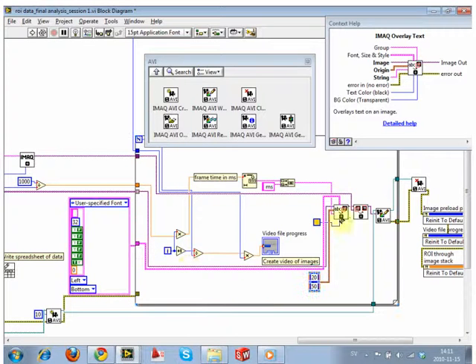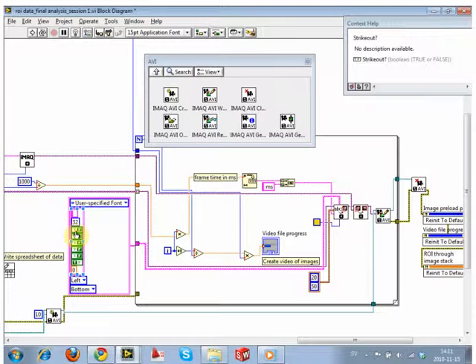So this is the constant value. Then we just choose, and if you hover over things, it'll tell you what they are. So this is if you want to strike out the text, if you want to have italic text, underline text, bold text, size of the font, everything associated with writing something, you can control.